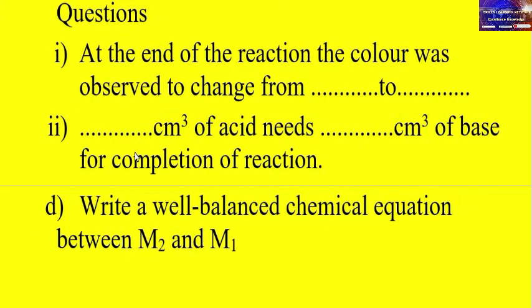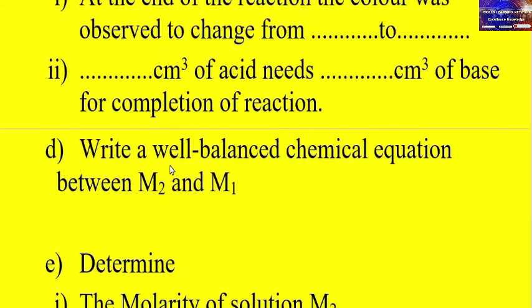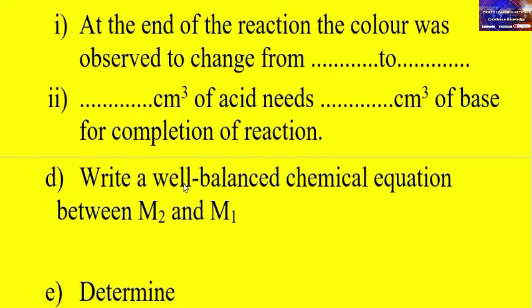Another question: what is the volume of acid required to neutralize the volume of base for complete reaction? Another question: write a balanced chemical equation between solution M2 and solution M1, that is the compound involved in solution M2 and in solution M1.